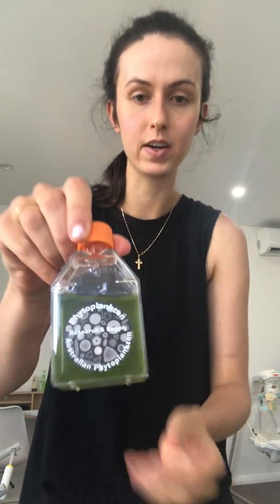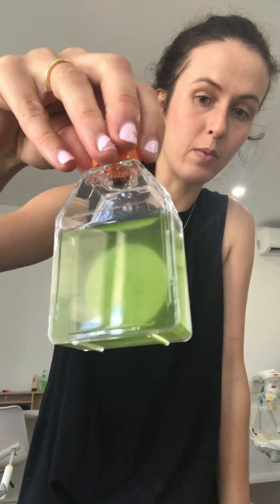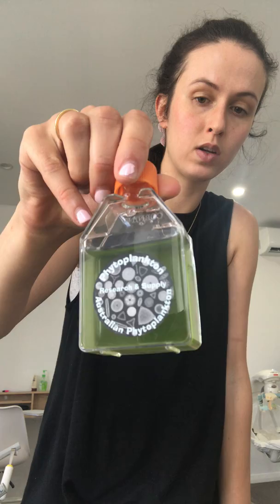Hi everyone and welcome back to Aquatic Life Food. Today is part two of how to culture algae. What we're going to be doing is take our algae, which has gone very green as you can see here, and we're going to split it in two and add fresh culture nutrients to each batch so that it has the nutrients it needs to grow even further.